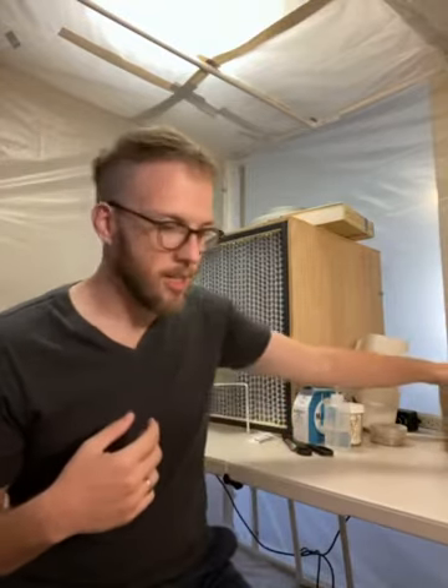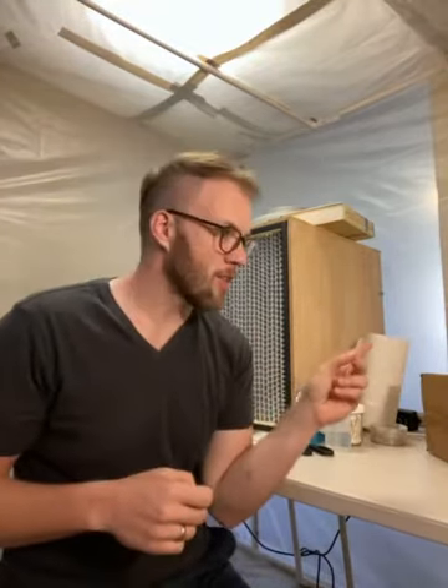Let's get to the fun part — the unboxing of the microscope itself. I'm not going to go through a whole lot today because it is incredibly hot across the United States, and I'm in a homegrown lab tent in my attic with no AC or ventilation. So today I just want to open up the microscope and take a look at its parts.